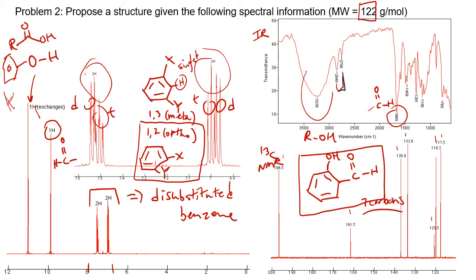So it's looking good. And just to come back to these IR peaks, whenever you see this combination of two peaks at 2700, 2800, in that region, this actually is a secondary stretching mode for aldehydes. And they always have 2 stretching modes. So sometimes if you have an aldehyde, you'll see those peaks in there.